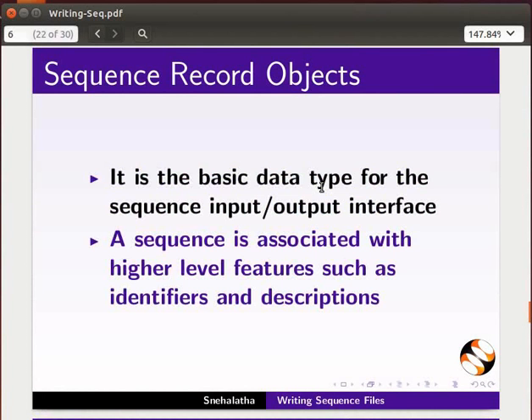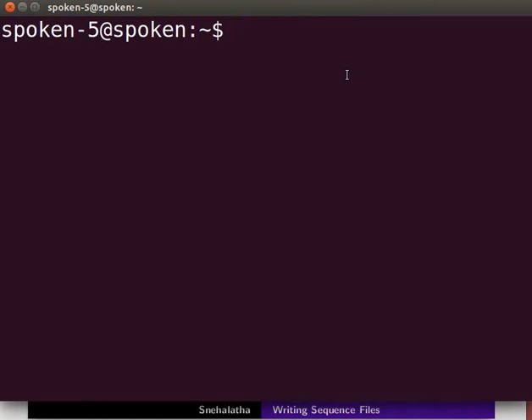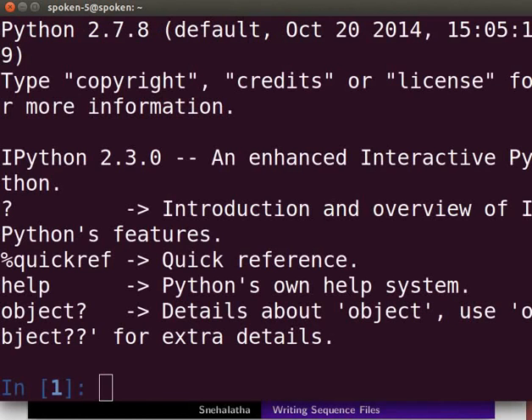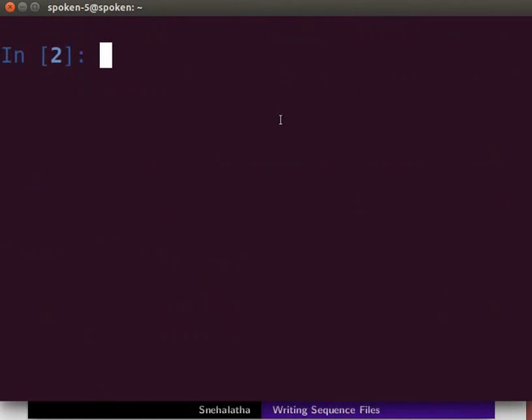Open the terminal by pressing Ctrl, Alt, and T simultaneously. At the prompt, type IPython and press Enter. At the prompt, type the following lines.